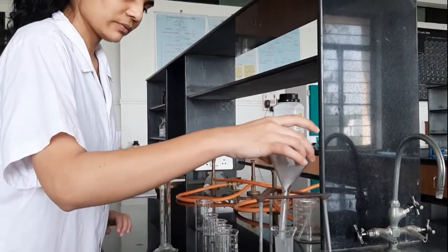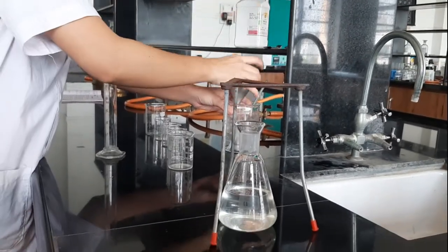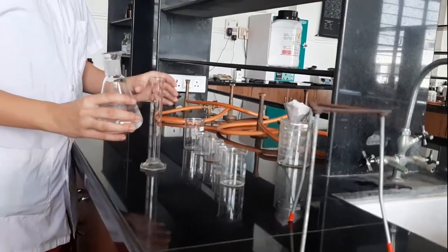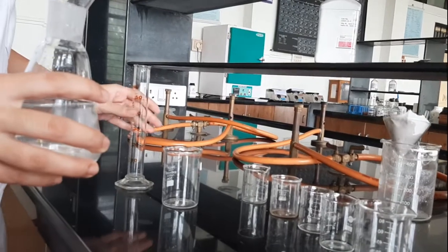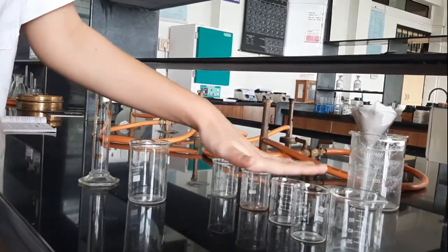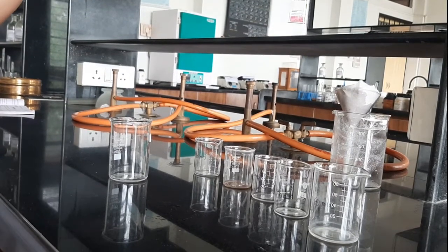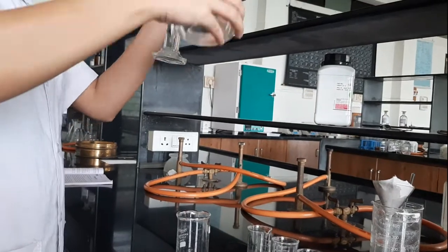Now complete filtration has occurred, and we will divide this filtrate into 6 parts. 30 ml we are going to pour into each of these beakers. We have labeled them as 10 minutes, 20 minutes, 30, 40, 50 and 60. So we will take 30 ml into each of these beakers.